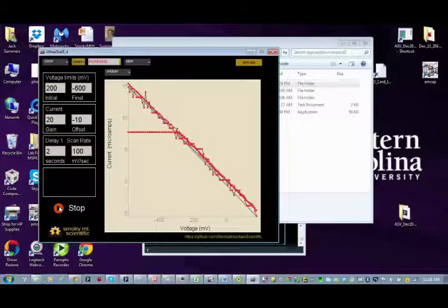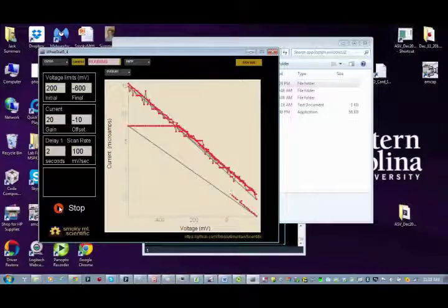Now this introduces an offset error, so now we're below the value where we should be seeing. Obviously, if we have the same voltage limits, we should have the same Ohm's law behavior for the current being passed across the resistor. This is a technical problem that we are working on. We'll get this fixed. It's just where we are in the development phase.